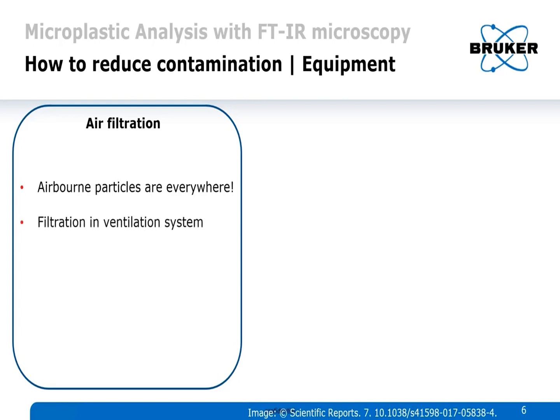Best done, it's in the filtration in the ventilation system. Have some overpressure in your lab, so that the filtered air is pressing out the air that is unfiltered and would come from the outside to induce contamination. And for quality control, you can have a particle counter in your lab.